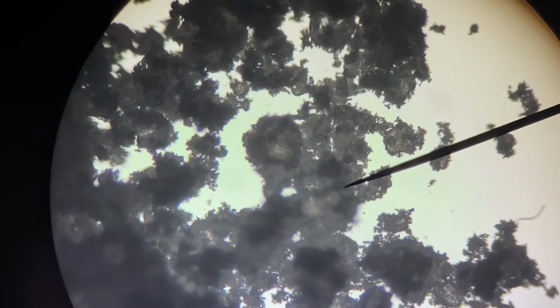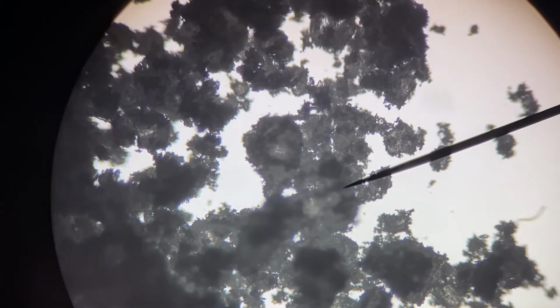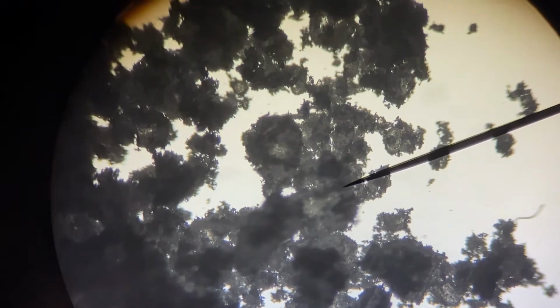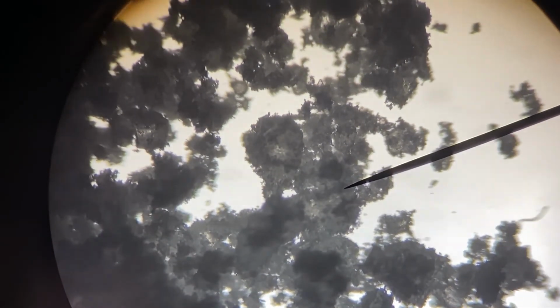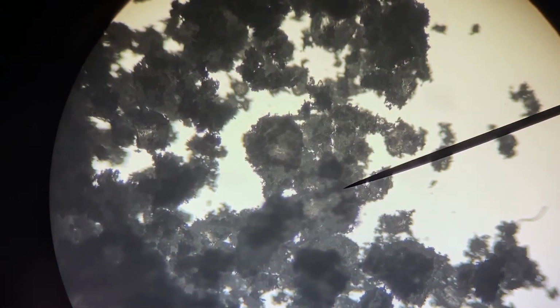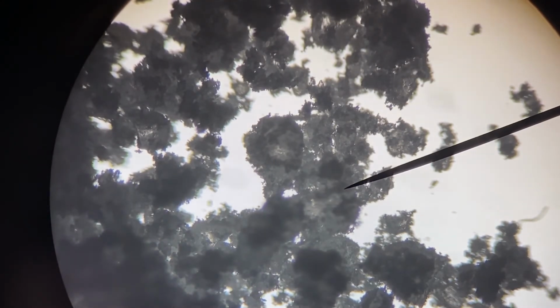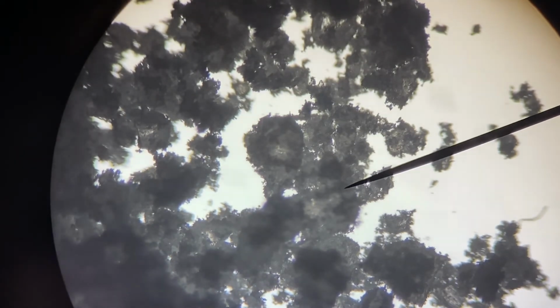Oh, wow, okay, it does not look the same. Okay, so now we kind of get some of the larger structures, but we lost that kind of crystalline structure. It doesn't seem, at least on this objective power, to be as chunky. Gosh, I'm really struggling to come up with a science word to describe this. The shape is still irregular, but now it looks more like chunks of powder than it did solid pieces. We also can't seem to see through those pieces as much anymore.